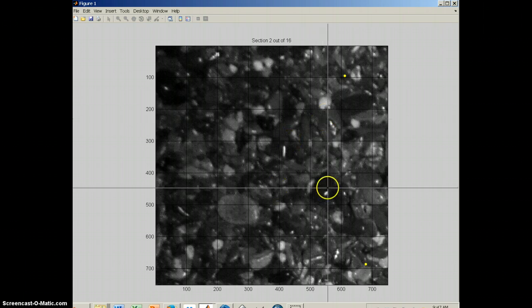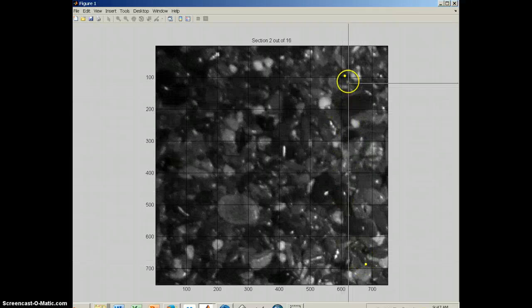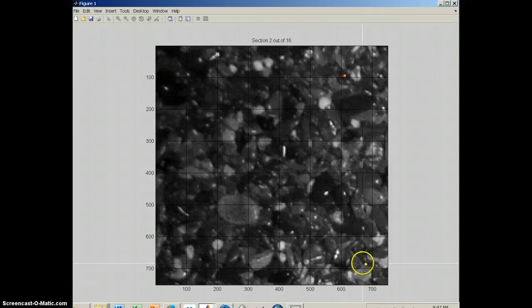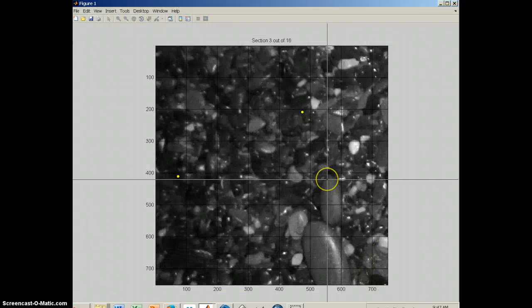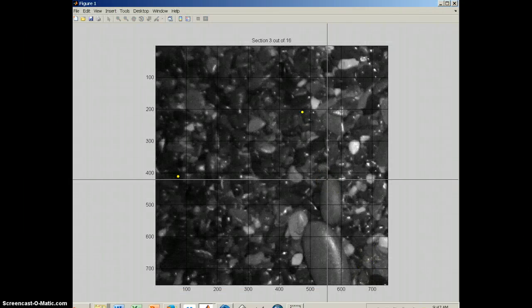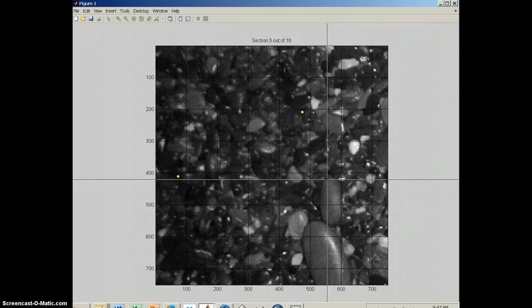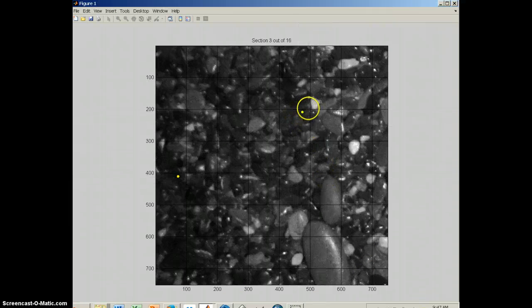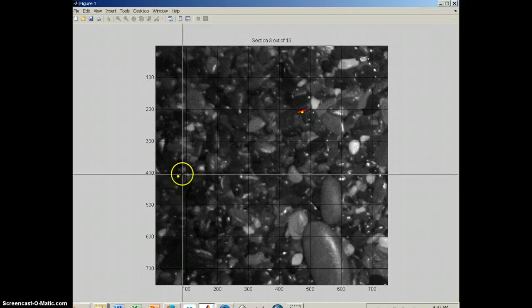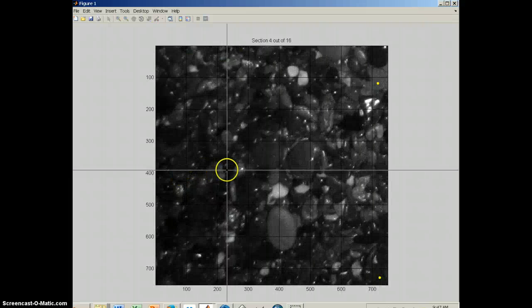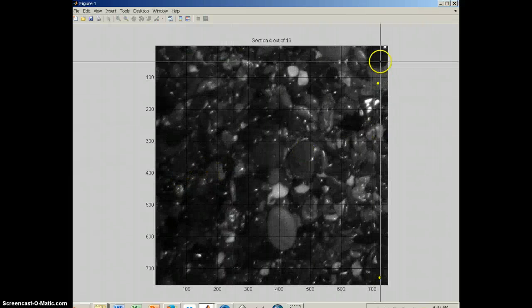So now I've come to the next part in which it's basically taken that photo, zoomed in, and it's got, in this case, two random dots, each falling on a grain. So what I do now is I simply go through and I see where that dot lies, and I draw a line across the grain. Once I've done the two, it's going to throw up another one, and I'm going to go through this process again, and it's just going to cycle through this photo.